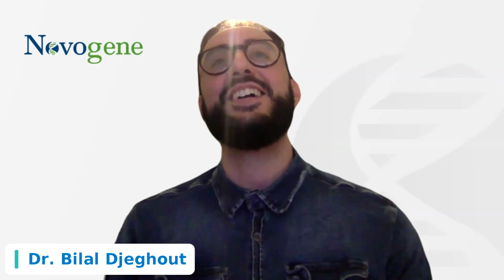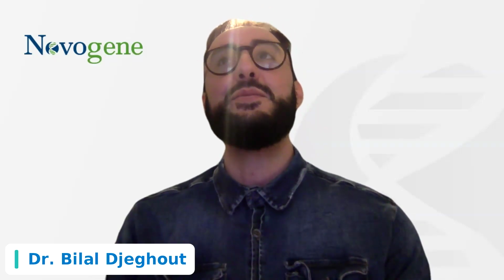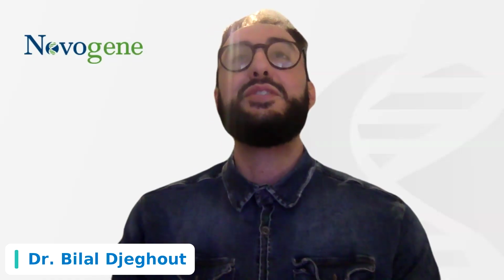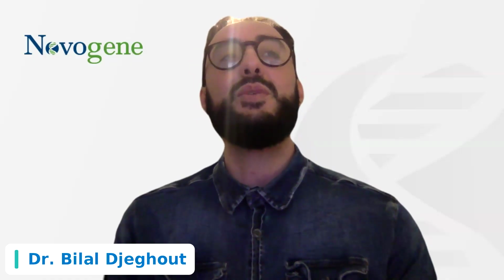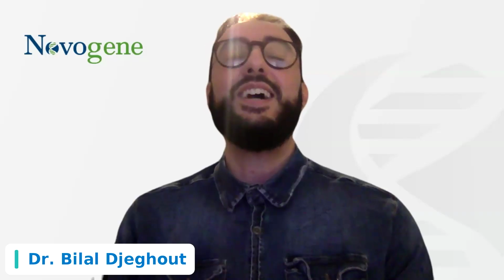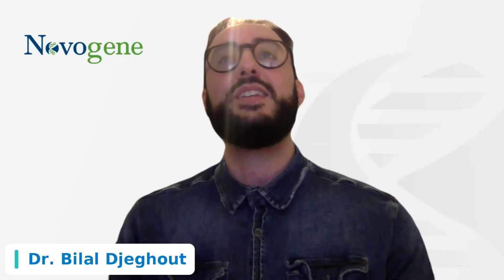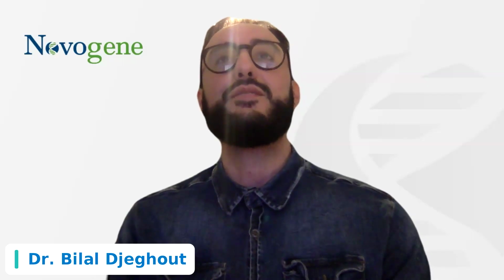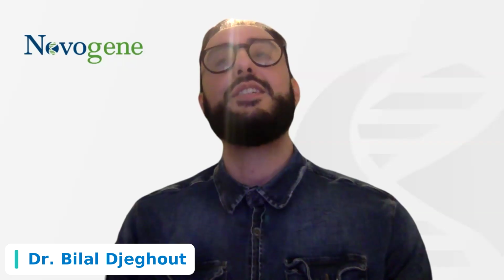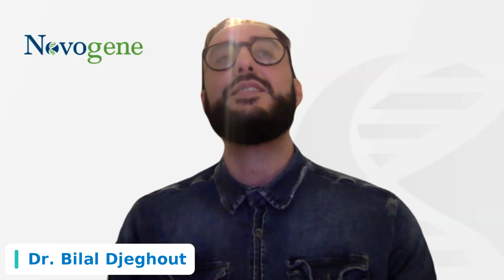That's Campylobacter. It has a really fastidious nature in the lab. Technically it should grow. So make sure that when you store it and make your stock, you have enough cells. I worked with different pathogens, like Salmonella, for example. You just have a tiny bit, you store it with glycerol and it survives forever and doesn't get much affected by the thaw and freezing cycle. But Campylobacter seems to be really sensitive.